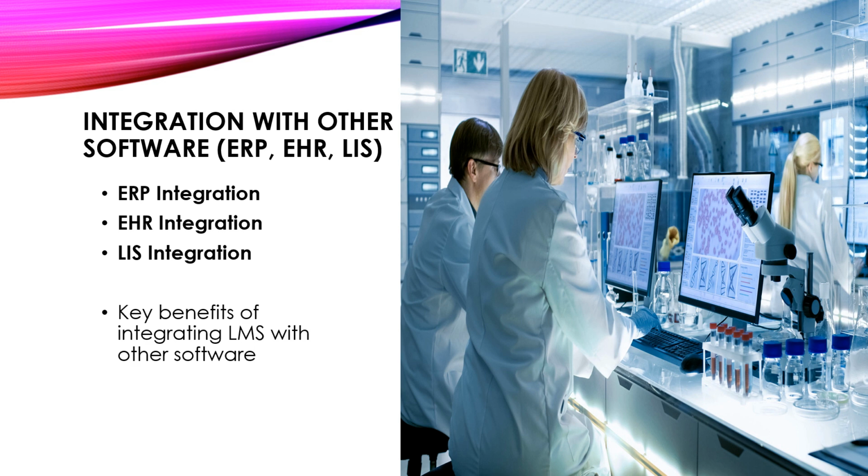First, ERP integration. Now, ERP systems manage various aspects of business operations, such as finance, human resources, supply chain, and inventory. Integrating LMS, that is laboratory management system, with ERP, enterprise resource planning, allows seamless sharing of data related to inventory management, procurement, billing, and financial transactions. For example, when a laboratory performs tests, the laboratory management system can automatically update inventory levels in the ERP system and generate invoices for billing.